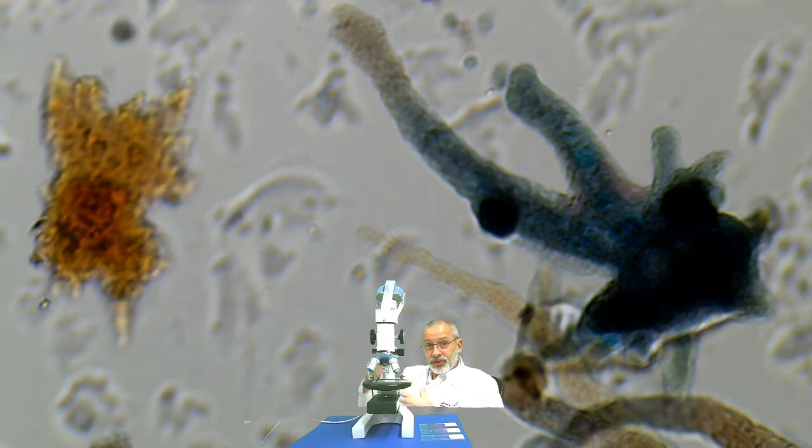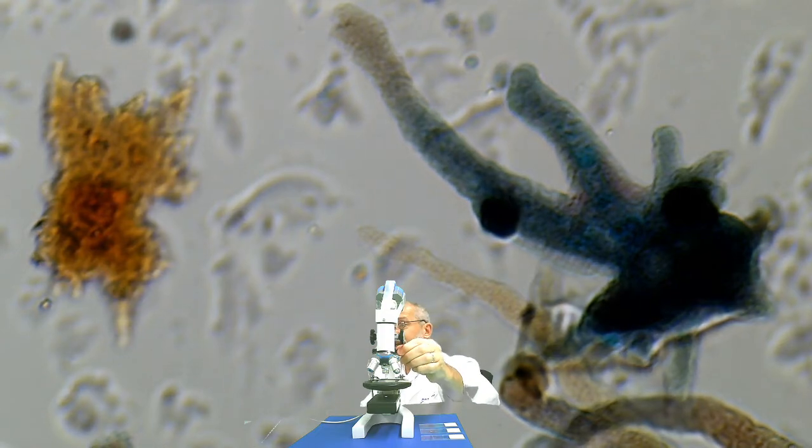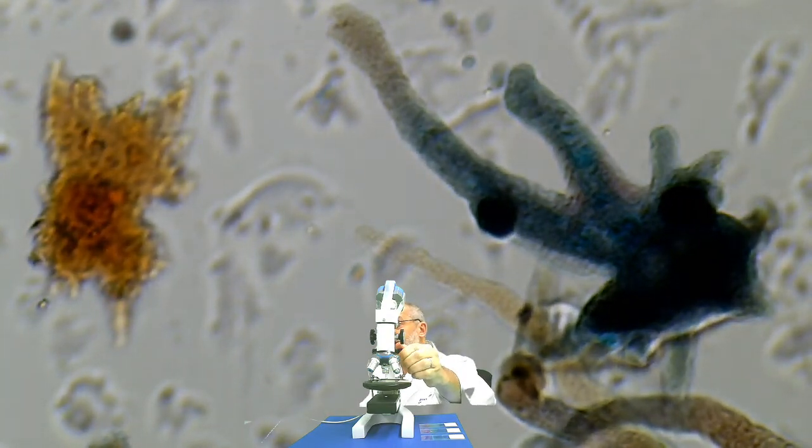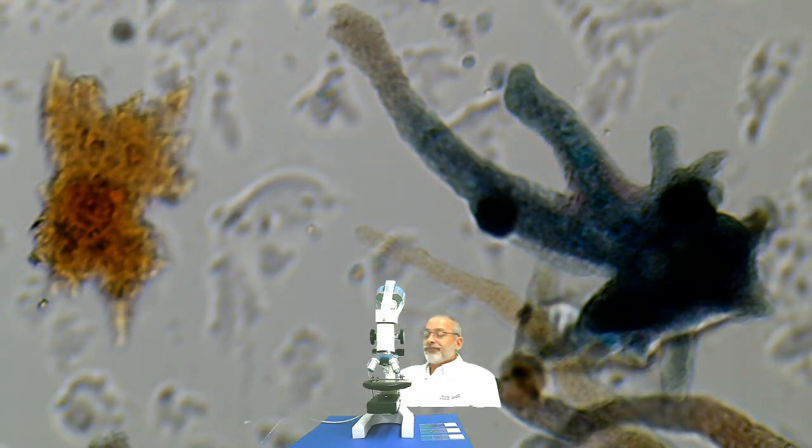They have depth to them. So if you use your fine adjustment, you can focus in on different layers of them and get them better focused at different depths. But keep in mind that they are not only three-dimensional, but when they are alive, they are moving as well.